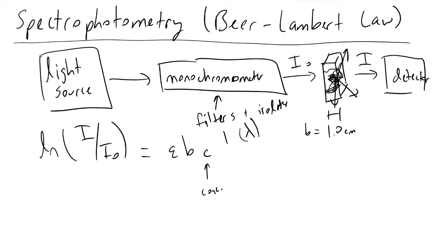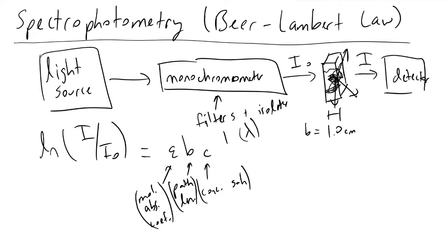So that's concentration of the solution, path length, and the molar absorptivity coefficient. And in practice, what we'll commonly do is make standard curves in order to correlate the concentration with the absorption.